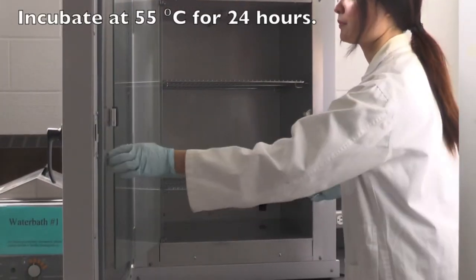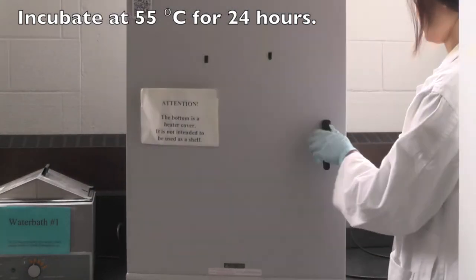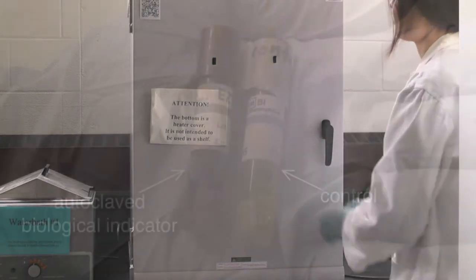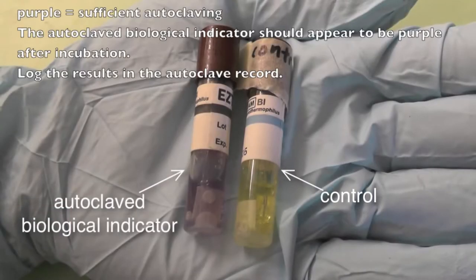Proceed to incubate at 55 degrees Celsius for 24 hours. The color of the autoclave ampoule should remain purple, indicating that the autoclave is functioning effectively.